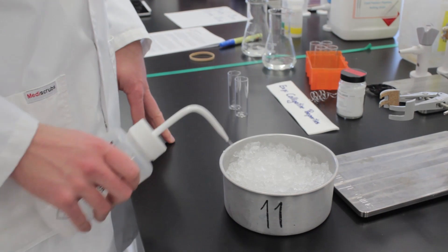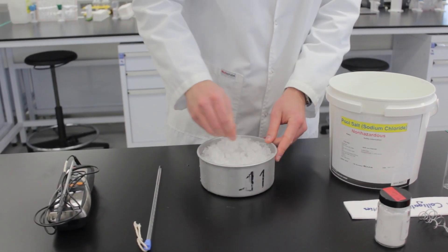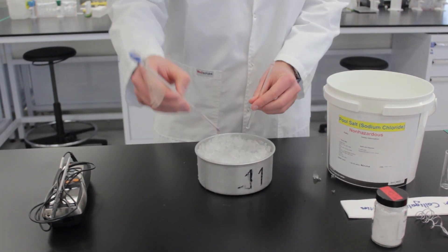To make our ice bath super cold we're going to add a few scoops of pool salt. Keep an eye on the temperature and make sure it's around negative 8 degrees throughout the experiment.